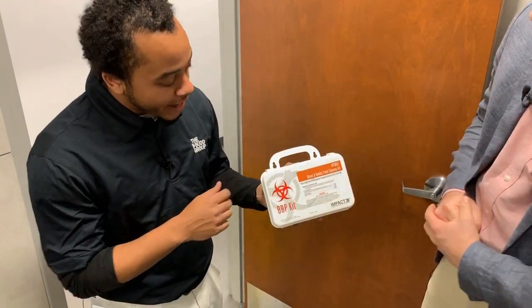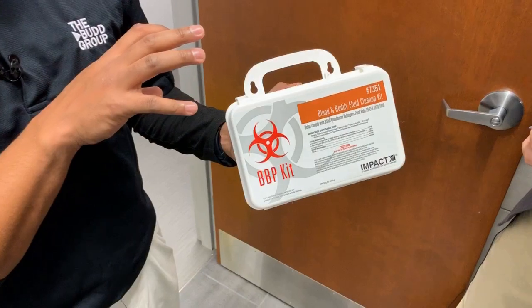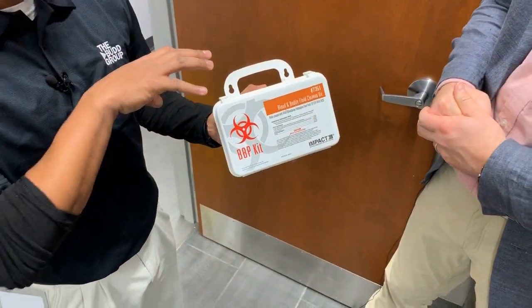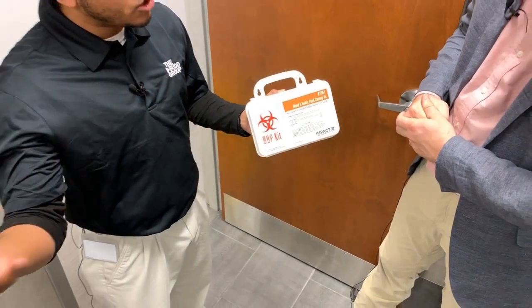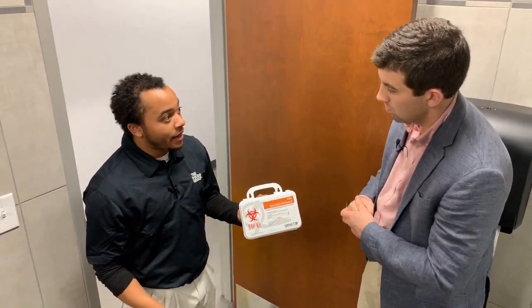Okay, what's that symbol you were pointing to? Well, this is a biohazard symbol. What that does is let people know that after we're done cleaning this, we need to put this in a hazardous materials waste bag, so that all contaminants are concealed, and people know that this is a dangerous substance in this bag. Gotcha.